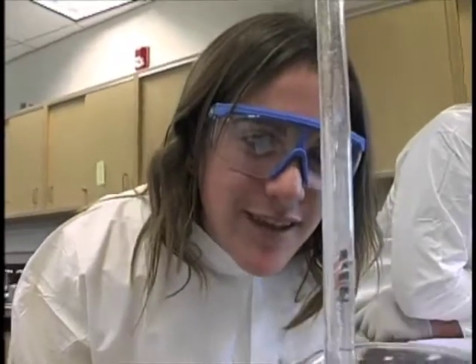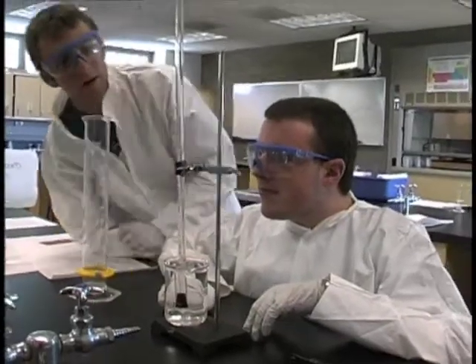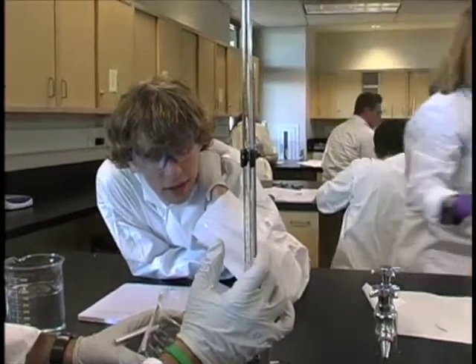It's going to go over right there. We're at, like, 33. Your bubbles are doing what?